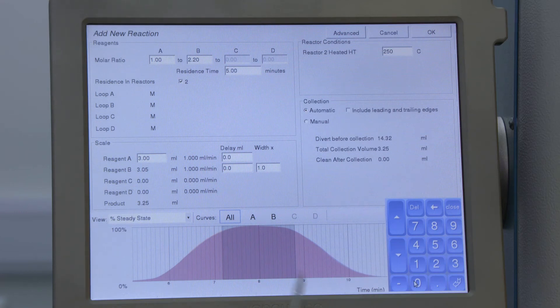I can use the dispersion model to help me decide this, because this will tell me how much of my reagent is actually at steady state in the reactor. This shaded region identifies that I have some reagent at steady state, and all of this reagent is diluted by the solvent before and after. So I'm going to increase the scale that I'm working at.